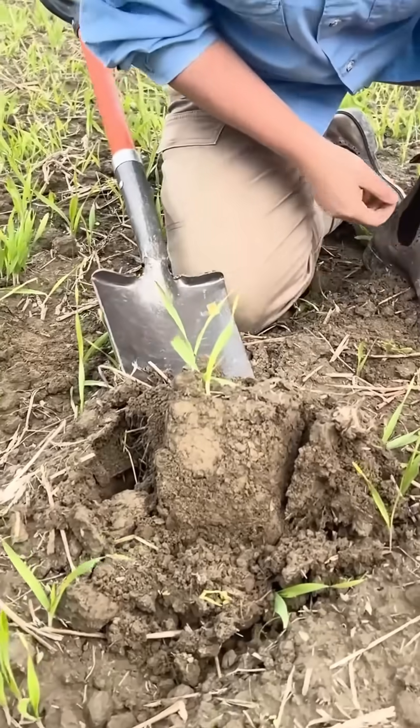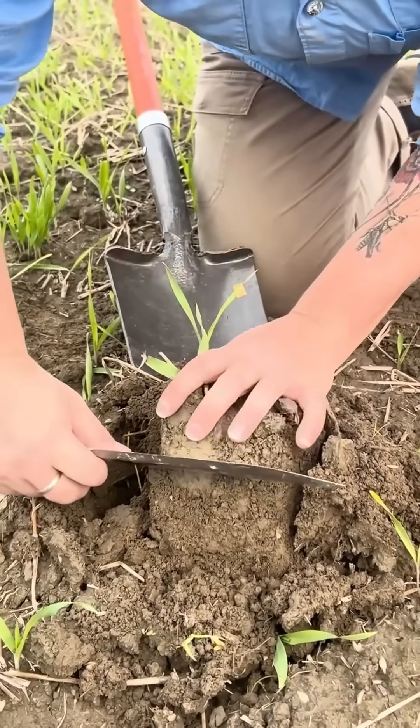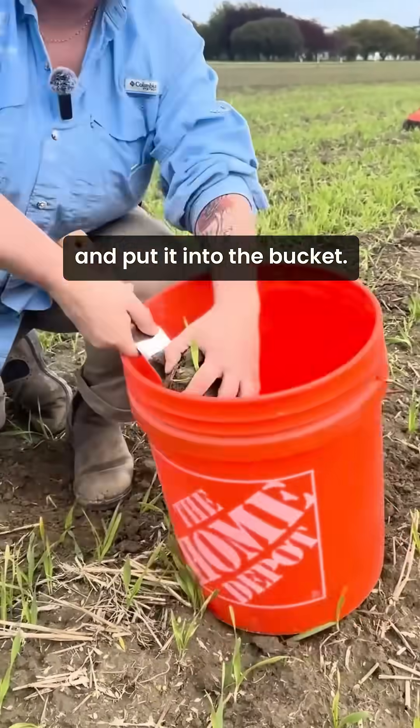There we go. We have our soil knife here; we're going to measure down about two inches and just cut that part off and put it into the bucket.